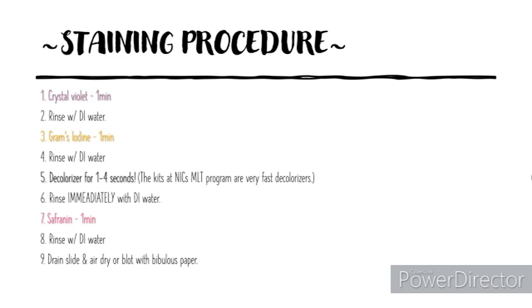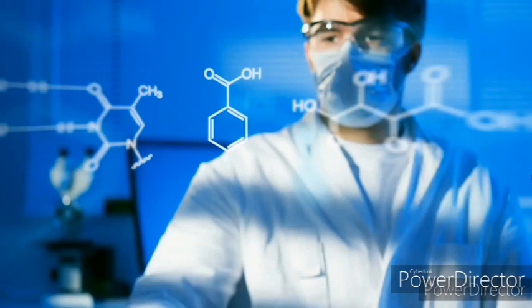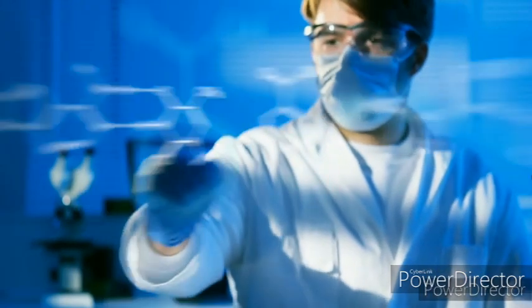Rinse immediately with DI water. We really don't want the decolorizer on for more than 1 to 4 seconds, or otherwise that could cause false results. Then the last 2 steps, we do safranin, the counterstain, for 1 more minute, and then we rinse that until it's completely clear, and then drain it and air dry, or we could blot with bibulous paper, which I do demonstrate in the other video. So here's the video.